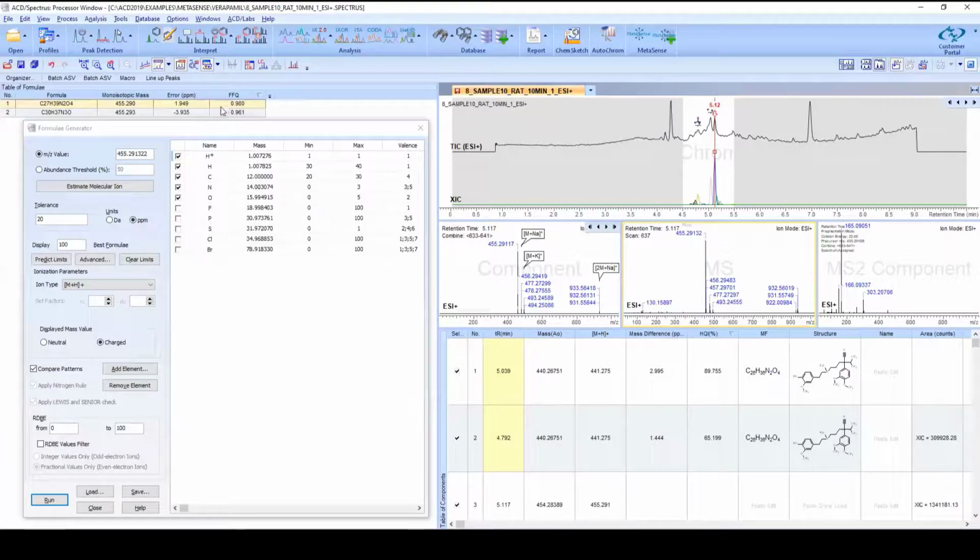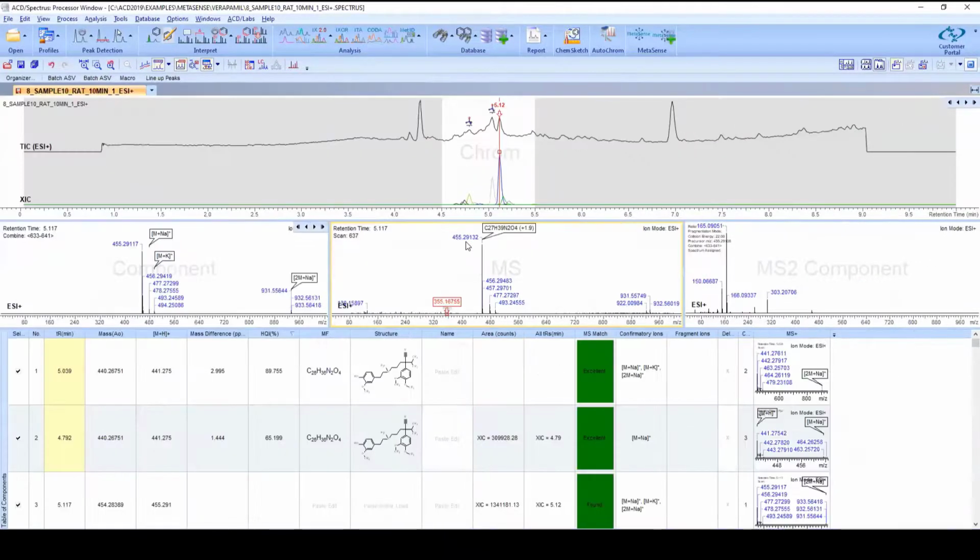It's possible that you have more formulas that have come up here. Maybe you want to use a range of formulas for the next step, but maybe you've decided that this formula is definitely the one that's of interest. I can right-click on that and annotate the peak. And what we'll see is that there's a little annotation that's been applied to the spectrum. So it just makes it easy for us to see it as we move forward into the next step. I'm going to go ahead and close this window for a second.